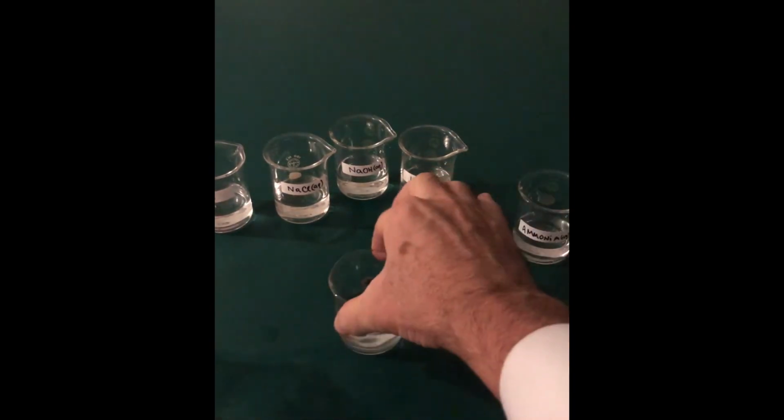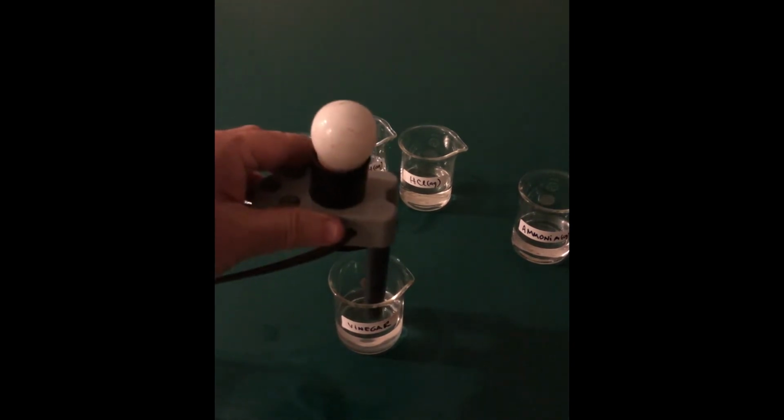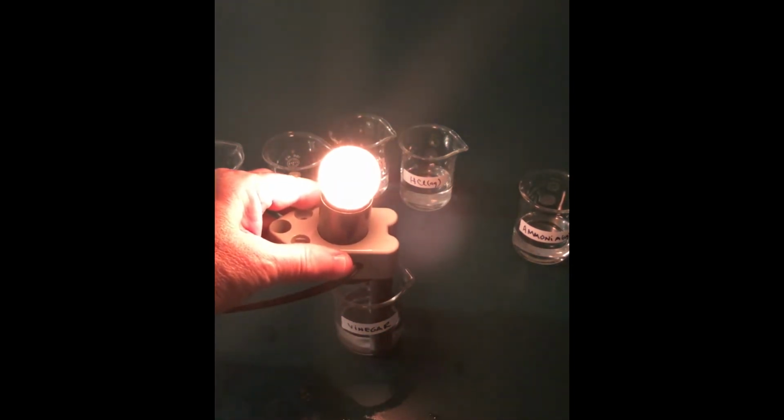Now, one common item in our household, I should say, is vinegar. Let's try vinegar out and see what happens. As you can see, the light bulb also turns on. It's a little dimmer than the one we had with the HCl and the NaOH and the NaCl, but it still lights up.